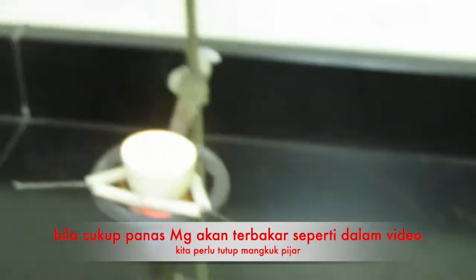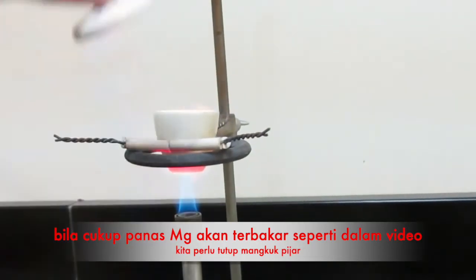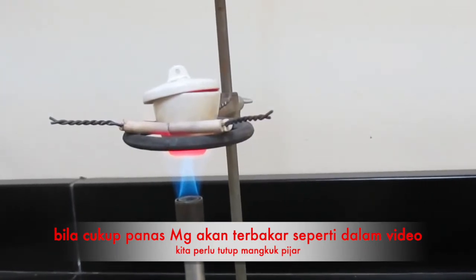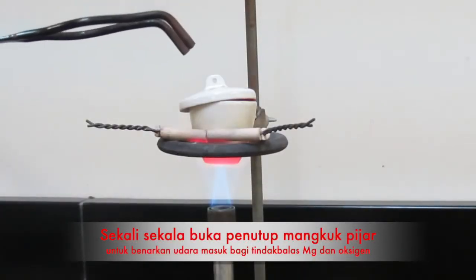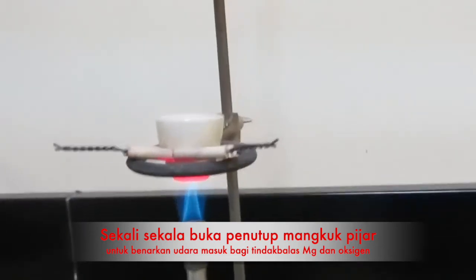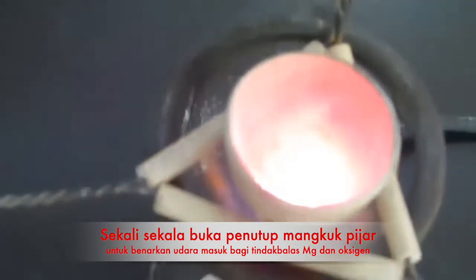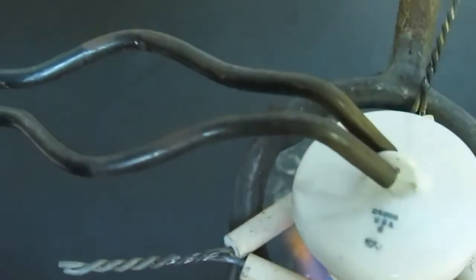We're going to put the lid on, and you should do that as soon as you see that happening in the lab. So we'll do that quickly. Just put the lid right over top. We'll leave it open just a little crack to let some air get in there. We'll use our crucible tongs, and we'll take the lid off just to let some more air in there. And let's take a look and see what we have. You can see it's still reacting a bit. We'll allow that to continue.